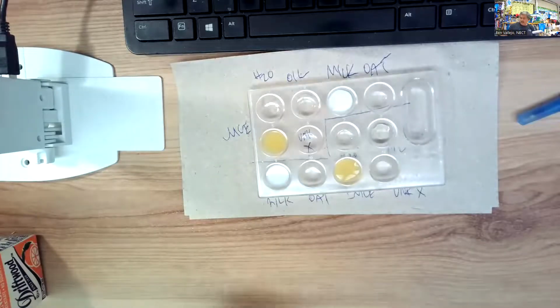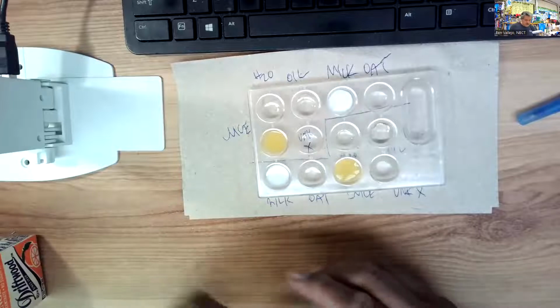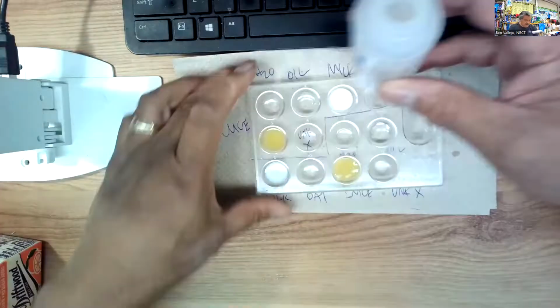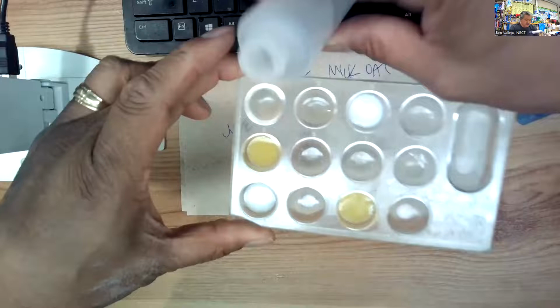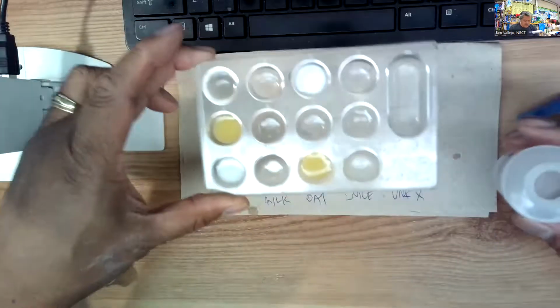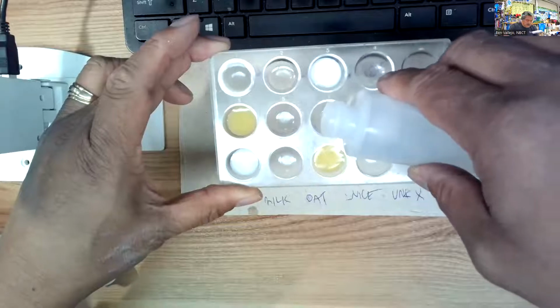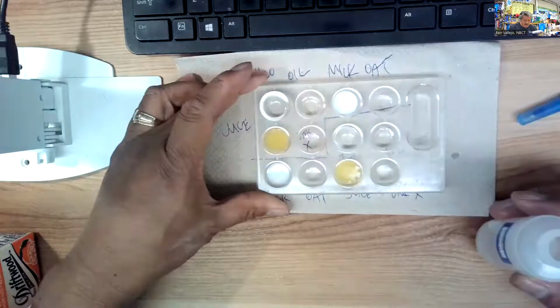And then water, you want to add just enough water so that you have about half full. So, ooh, that's a little much. It's this one right here. All right, did better on that one.